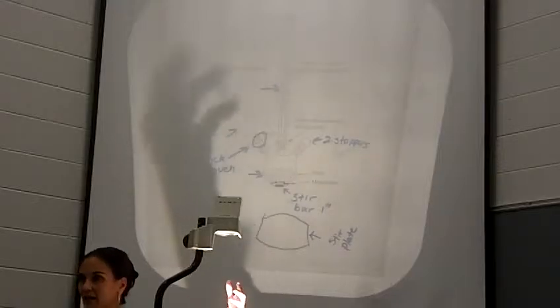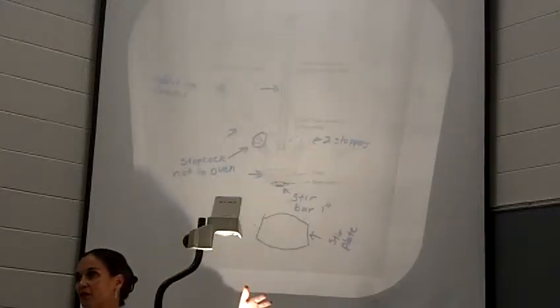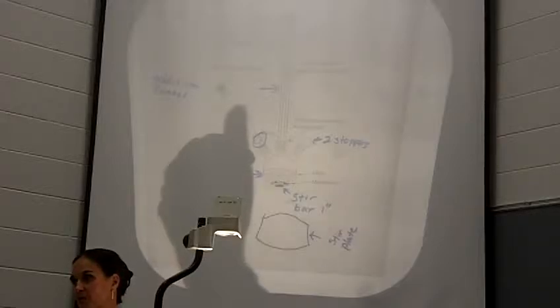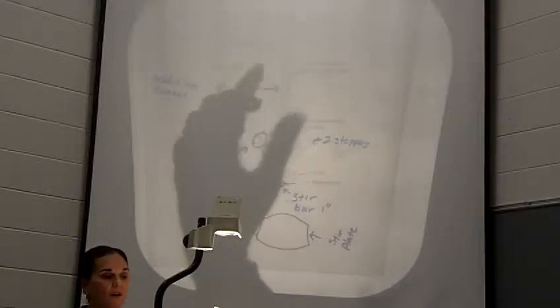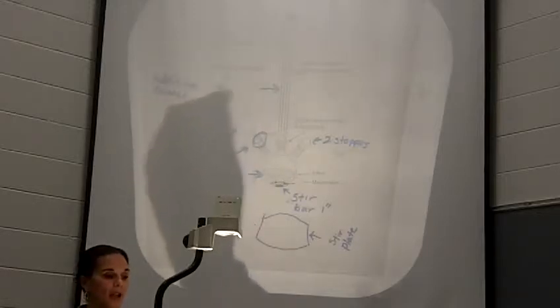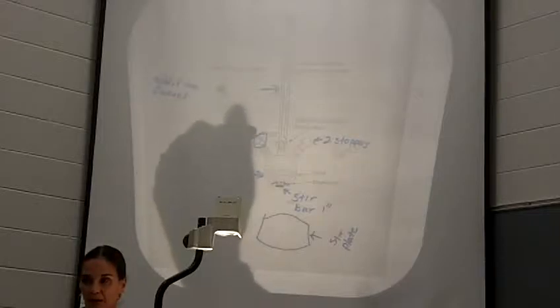It will mix as it's dropping into the separatory funnel. So you don't have to separately make a solution of the alkyl bromide. You'll just make your solution by putting it into the separatory funnel, okay? That way you don't have to worry about exposing your ether to more oxygen and water and having it get wet. Just put ether in first, then alkyl bromide.